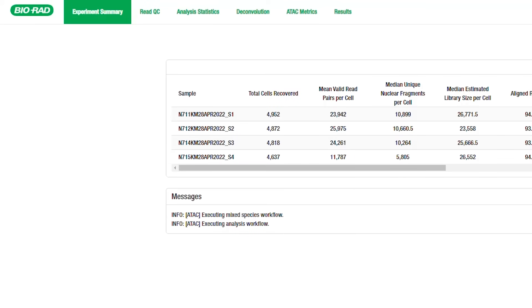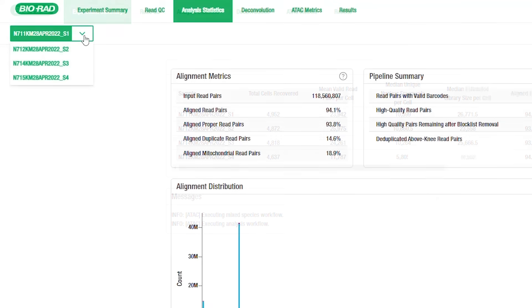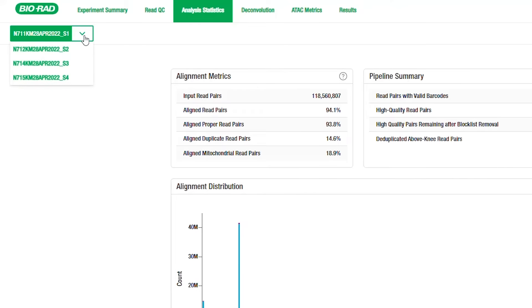At the top of the report are six tabs: experimental summary, read QC, analysis statistics, deconvolution, ATAC metrics, and results. On the left-hand side is a drop-down menu you can use to switch between different samples if multiple samples were processed together through the analysis workflow. If you are not sure about what a metric means in each table or graph, hover your cursor over the question mark on the right-hand side for more information.